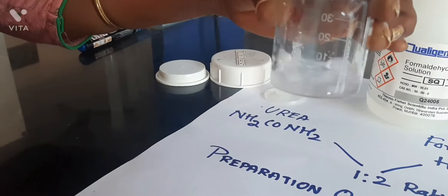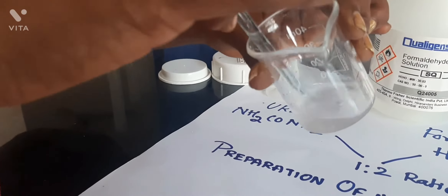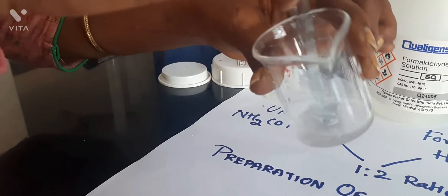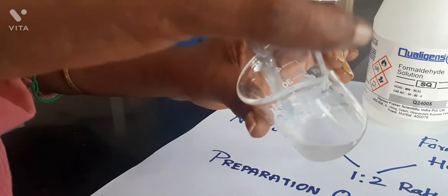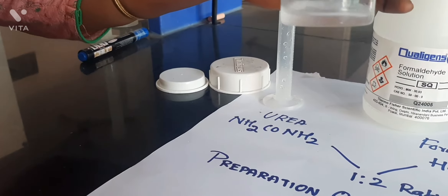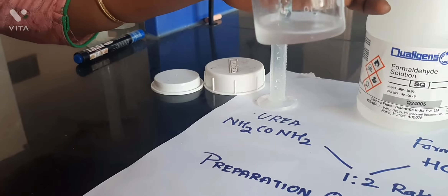When it turns into a transparent solution, at that time we can add 1 or 2 drops of concentrated sulfuric acid. While adding concentrated sulfuric acid, we should be very, very careful because it is highly corrosive.